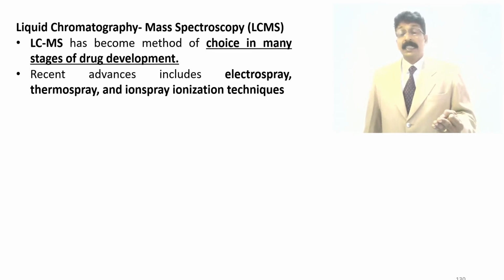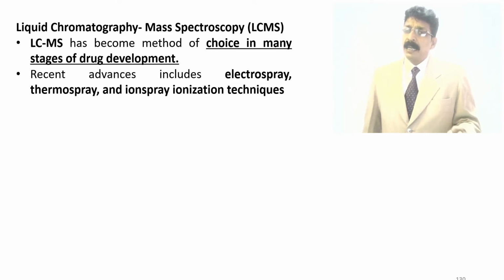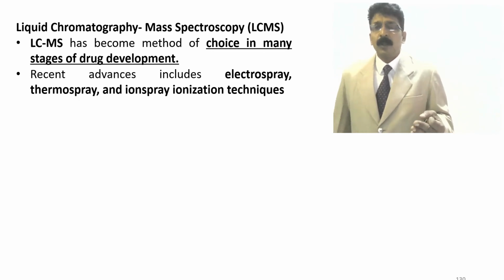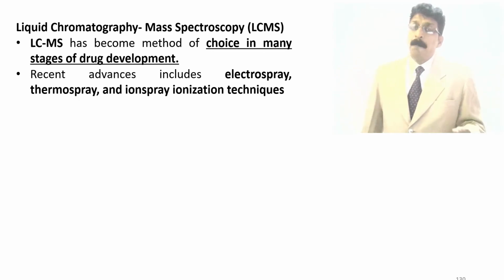Because in recent years, the compound which is getting separated from liquid chromatography, that means HPLC, directly enters into the mass spectroscopy, where it should be ionized.